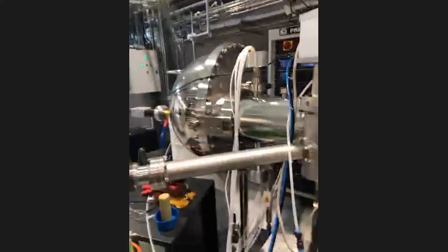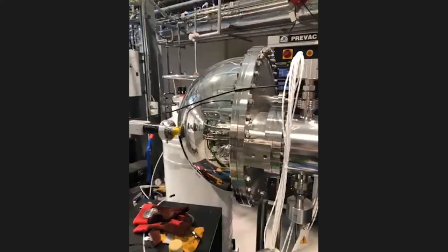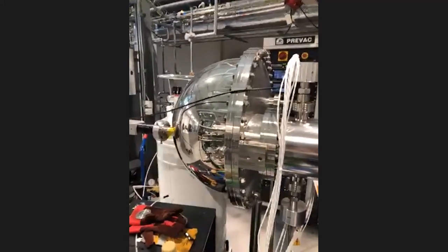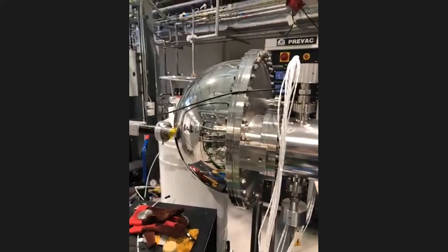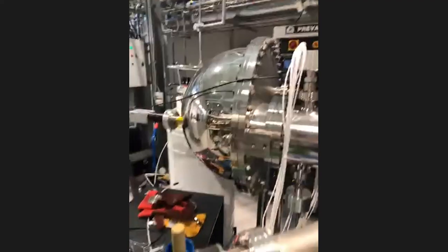The next very important part of the Beamline, probably the most important part of all ARPES measurement system, is the hemispherical electron analyzer. It lets us analyze the angle in which every photoelectron has been emitted and its energy.